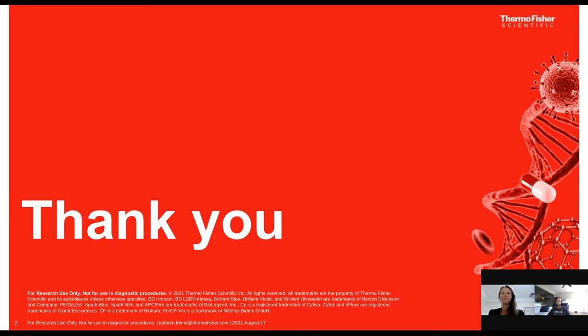Let's get started. Our first question is, will there be any issues when using DNA viability markers and NovaFluors? Thanks. Good question. I'm not sure that we addressed it earlier, but DNA viability markers will have an issue, yes. These are DNA-based products, and so any kind of intercalating dyes that are going to bind to DNA are going to react with the NovaFluors. And so we do not recommend using anything like your propidium iodide, for instance, or any other intercalating dyes.